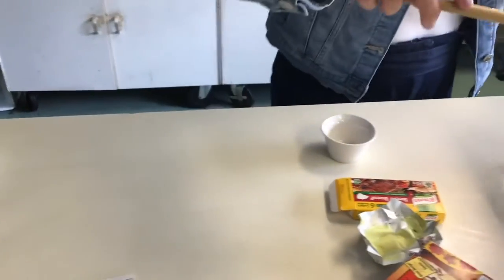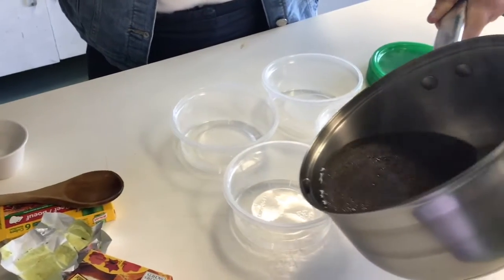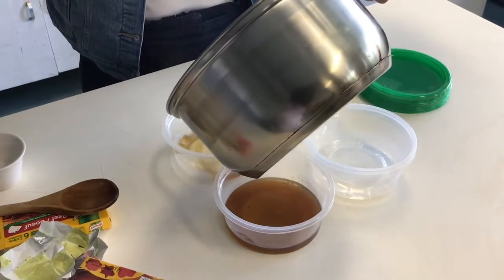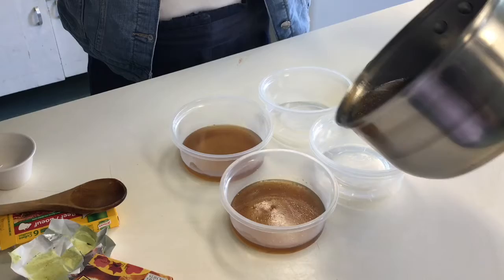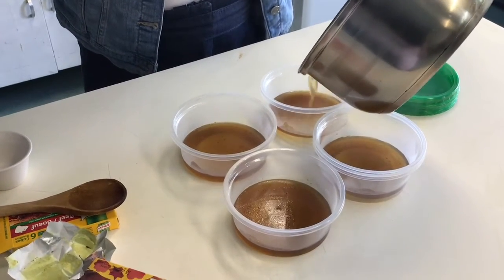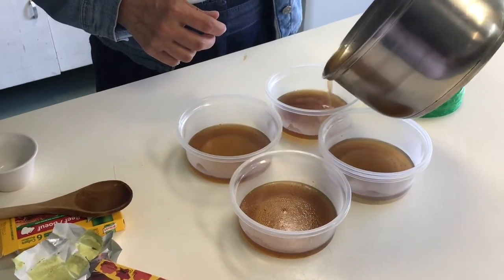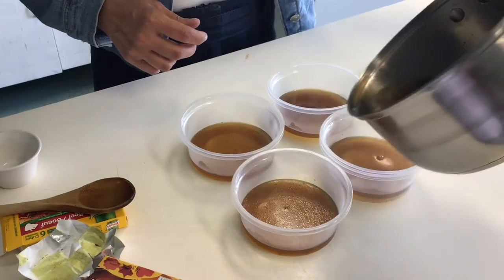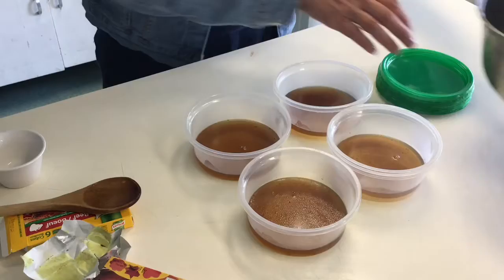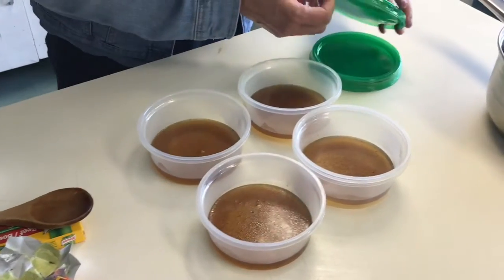Now it's dissolved. We will pour this into the petri dishes — just enough to cover the bottom, maybe a little bit more. The gelatin will make it set; it'll be like jello. This is what it looks like.